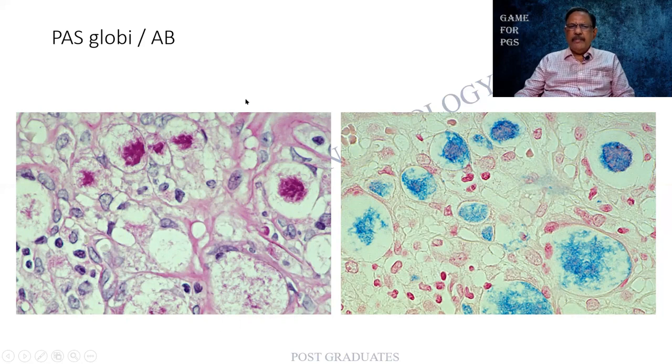It is an Alcian blue stain. So when you people are asked about the various stains, you can mention PAS also, Alcian blue, but these should be last in your list, or you should be strong enough to defend your diagnosis. These are very well given in any of the texts of histopathological techniques.